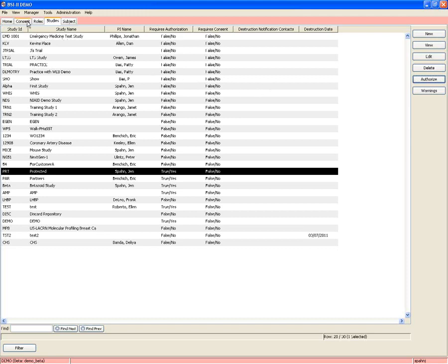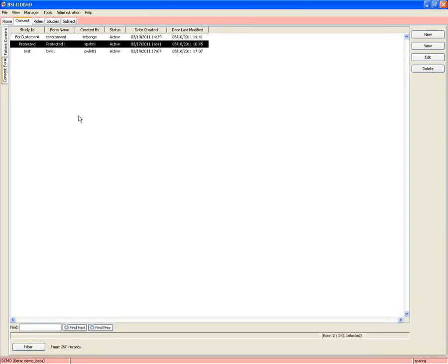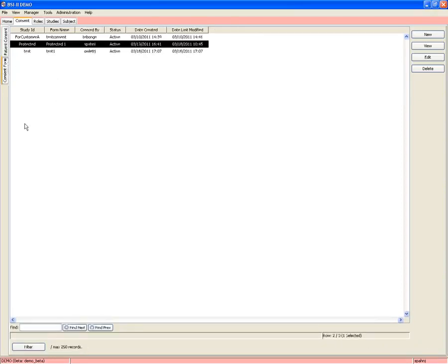The next thing I'm going to do is go to the consent module. What you're looking at is the consent patient manager, but the whole module has two tabs. We've moved to this two-tab manager for a couple of different modules in the system, including the new kits module, including the study module. So here, if I click on consent form, I can define my consent forms, and here I can add consent for individual patients. So keep an eye out for this new type of manager in the system.